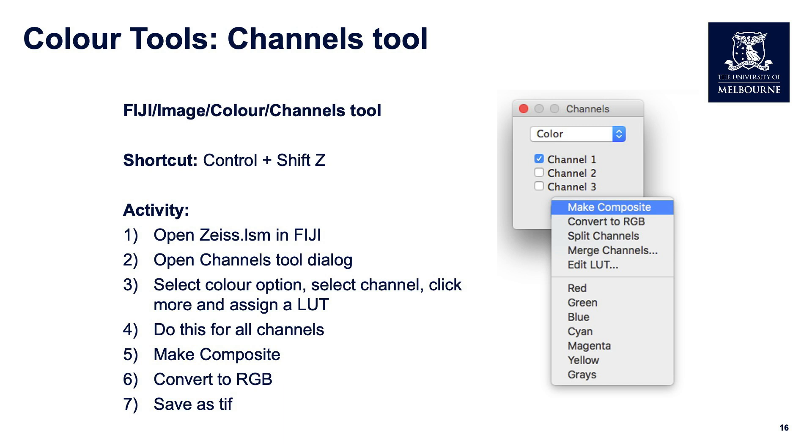In this case, we are going to change the channel lookup table and merge an RGB, but within a stack. So we're not going to split the channels out, recolor them, and then bring them back. We're going to keep it within a stack.